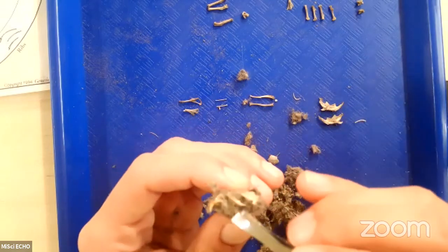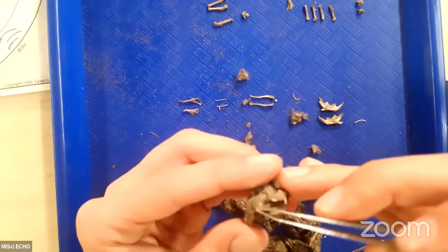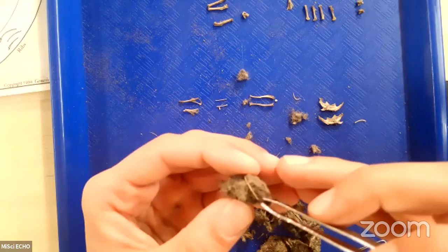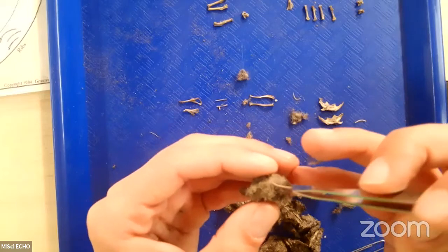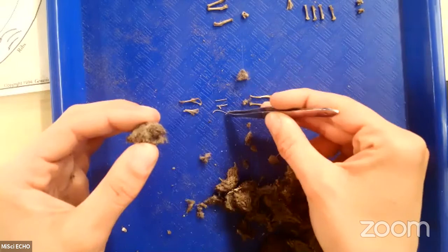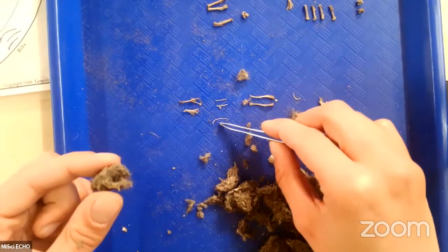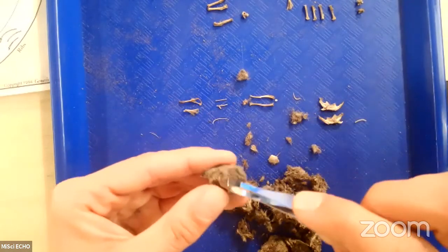But we'll only be able to tell what animal this came from if we get off a little bit more of that fur, which is also indigestible by those owls, right? There's no nutritional value to fur. And so that's one of those things that gets regurgitated since it's not absorbed by their digestive system as nutrients. But even packed into the skull, I'm finding small things like this, an example of a rib of one of our animals, which we can compare to our dissection sheet as well.